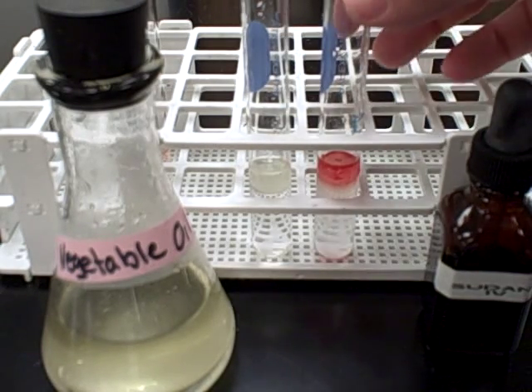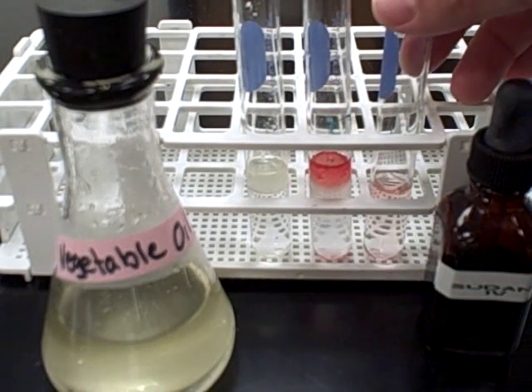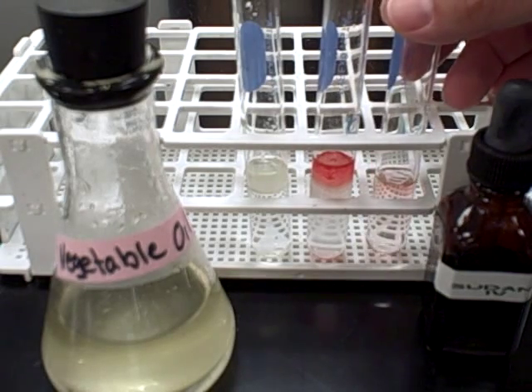This strong red color is indicative of a positive reaction. You can also compare it to the light color that was the result of a negative reaction with the distilled water.